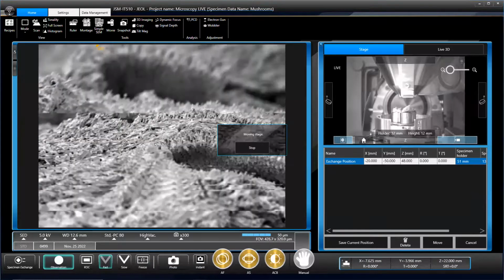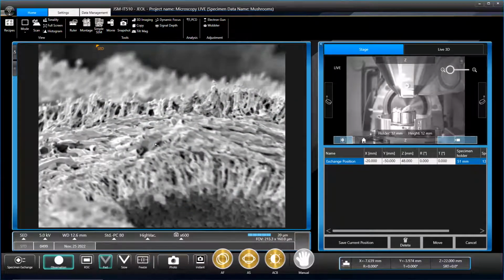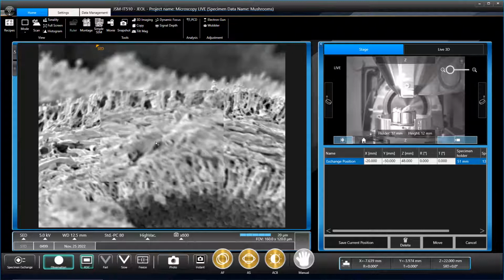Tell us more about your research. On the website it says you're a molecular ecologist. What is that? I study small things using DNA technology, basically.